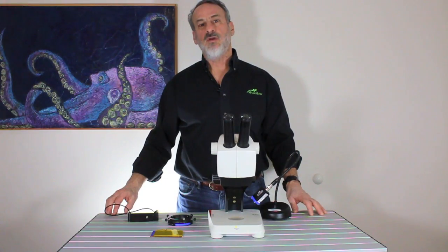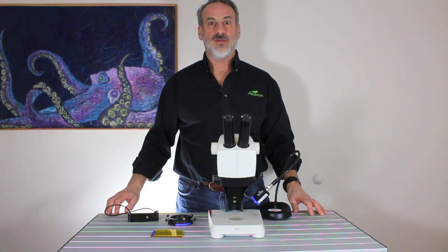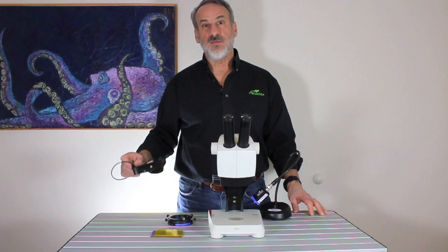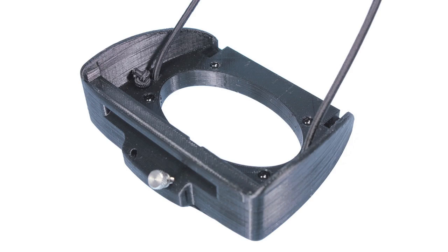This simple arrangement works with a very wide variety of makes and models of stereo microscopes, but there are exceptions. We have developed an adapter specifically designed for use with the Leica EZ4 series, with or without the attached camera.